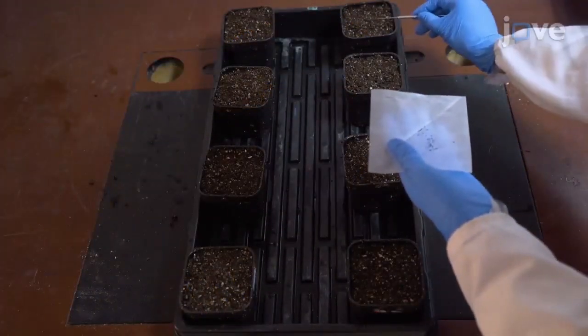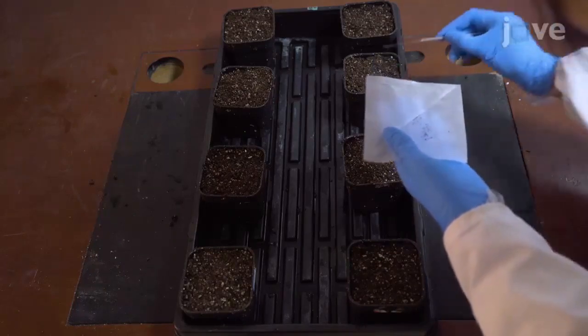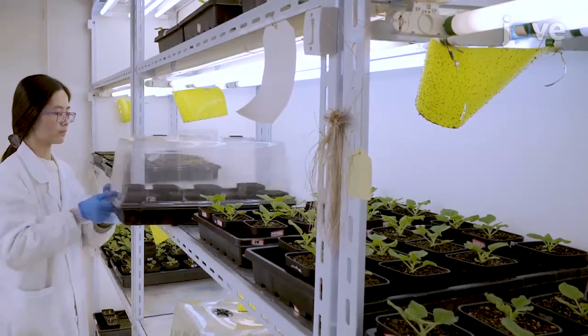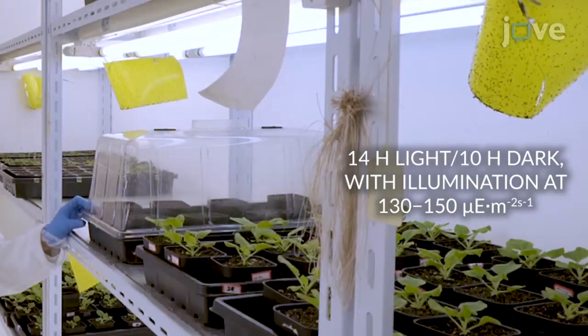Sow one or two seeds of Nicotiana benthamiana 16c onto the soil surface of each pot. Cover the tray with a plastic dome and allow the seeds to germinate. Place the tray under light and temperature-controlled growth chambers with a temperature of 23 to 25 degrees Celsius, 50 to 60% relative humidity, and a long day photo period.